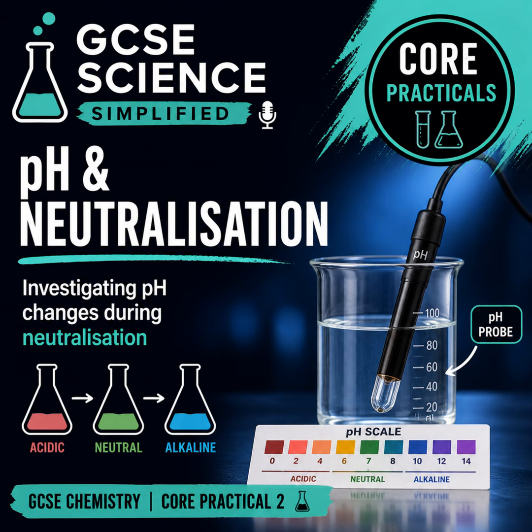So, how do we improve all of this? Well, we use a pH probe instead of indicator paper, and we add small amounts of base in and around that neutral point. We can repeat our readings and calculate a mean, discounting anomalous results. And this is exactly the kind of thing examiners want to see you say.